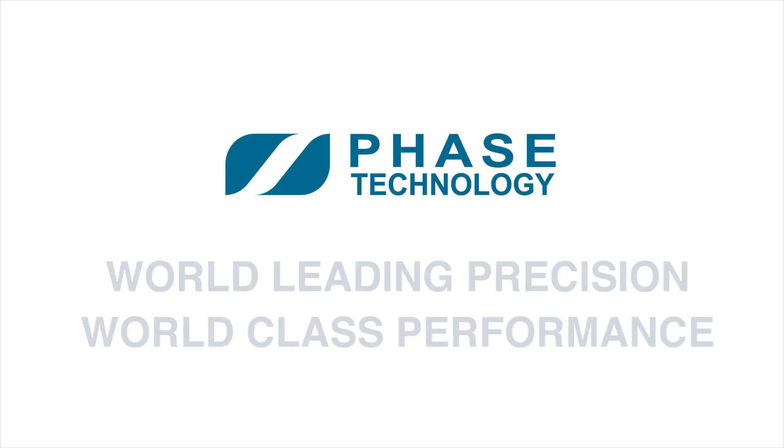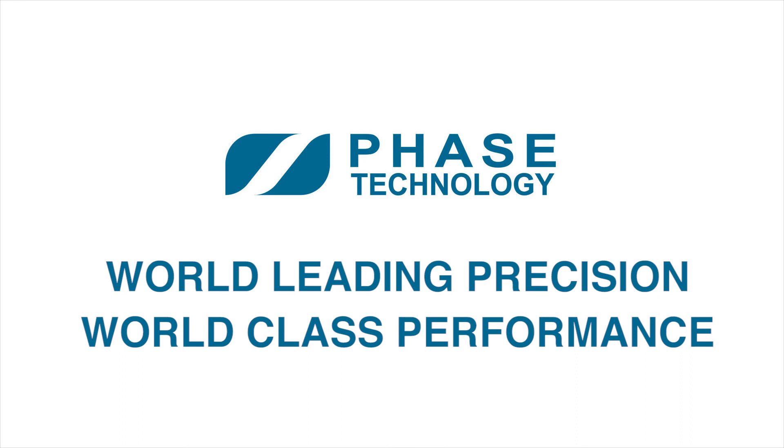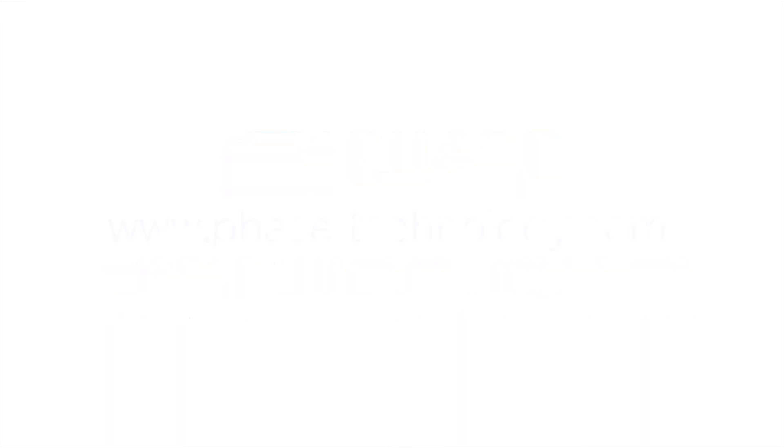Phase Technology. World-leading precision. World-class performance.